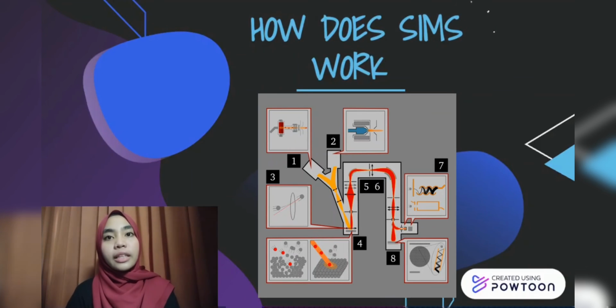If the electrostatic analyzer sector precedes the magnetic sector, the design is referred to as forward geometry. The advantage of this configuration is that the electrostatic filter reduces the energy range of the secondary ions so that they can be separated into independent ion beams by passing them through a magnetic field. In this configuration, multiple ion beams can be measured simultaneously.